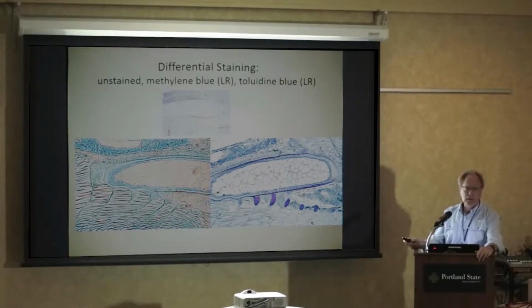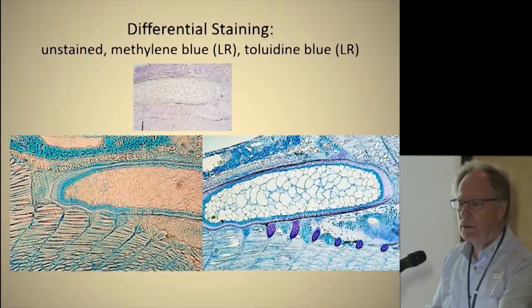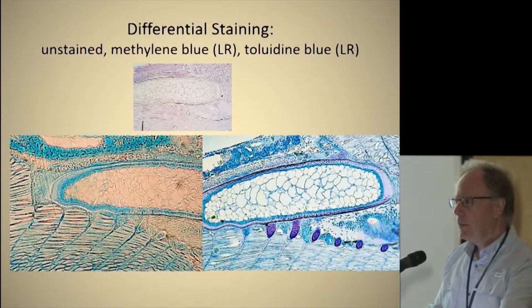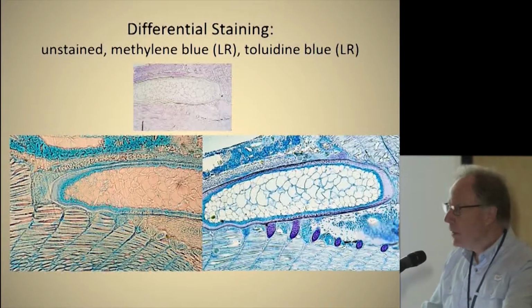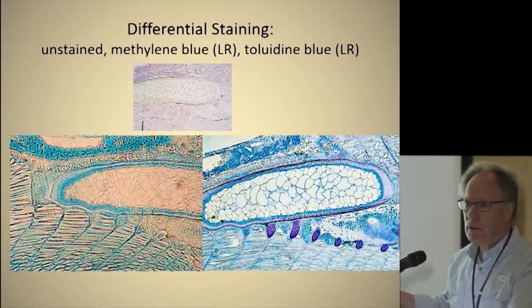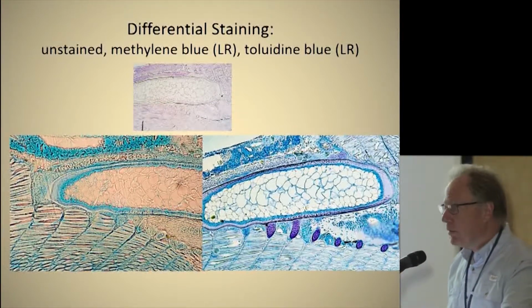And the other thing about it is, again, if you leave it on there longer to get a deeper stain, the downside is that it will stain, of course, all the media. So there's some, the JB4 resin media up there that would be a deep purple as well. But since it is alcohol stain, then you can wash it with alcohol as opposed to water and eliminate everything that isn't bonded onto some sort of tissue. So that's really where this came from. I much prefer it as an image.